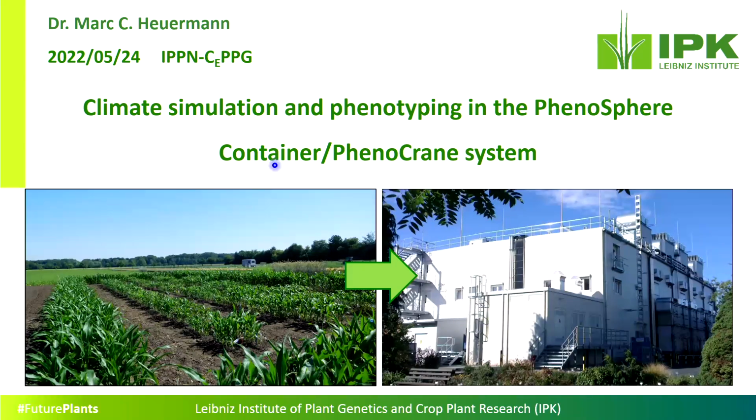Thank you, Thomas, and hi to the audience online. So my talk has as a title, Climate Simulation and Phenotyping in the PhenoSphere Container in PhenoCrane System. And as Thomas has teased, I am going to talk about the benchmark experiment, which was benchmarking the capabilities of the PhenoSphere to actually simulate field-like conditions.